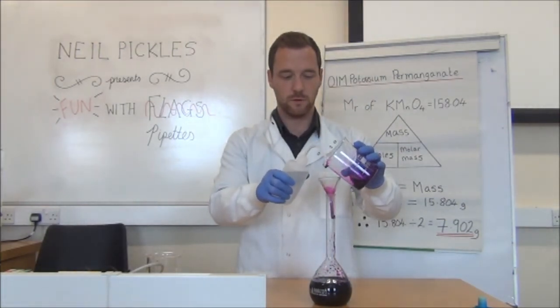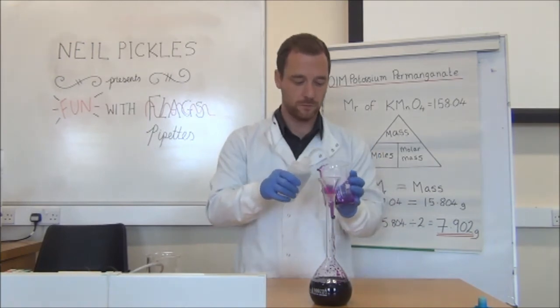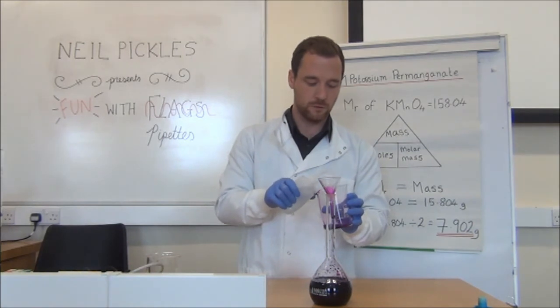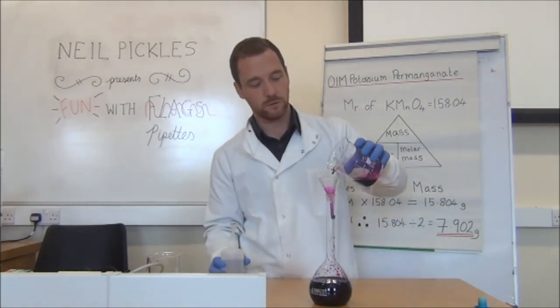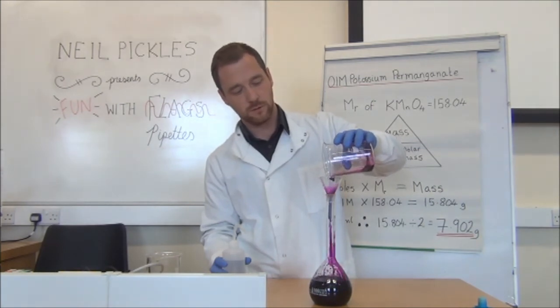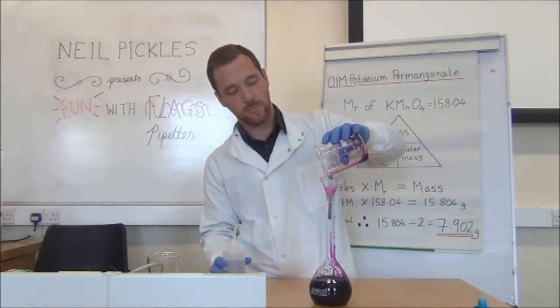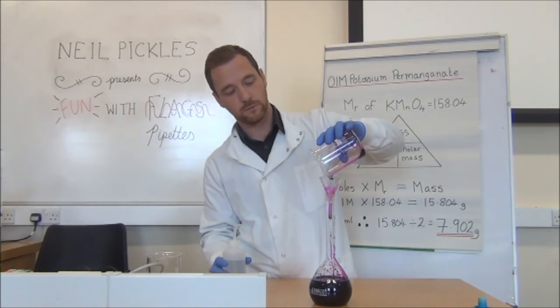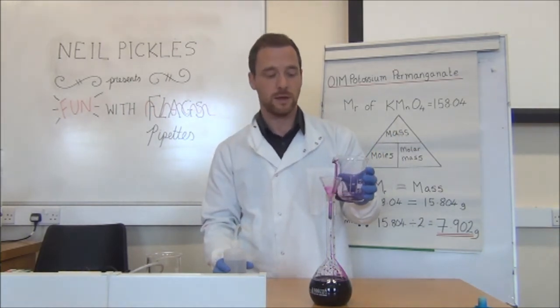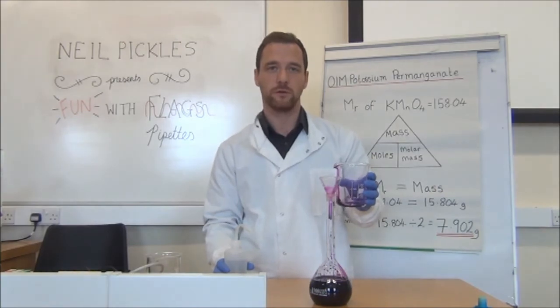Now you are not necessarily going to know if this has been successful with yours, because it may be a colourless solution. So my advice is just to rinse as many times as you can until all of the solution has been transferred. So we'll now skip to the next part where I show it making up to a final solution.